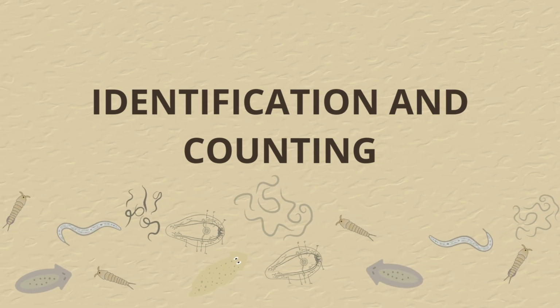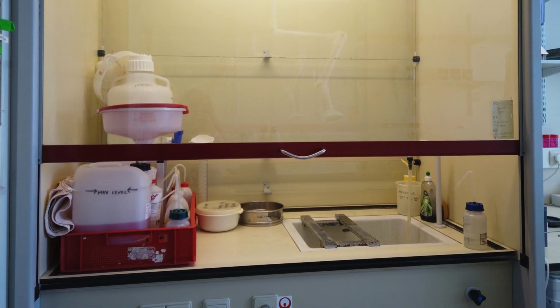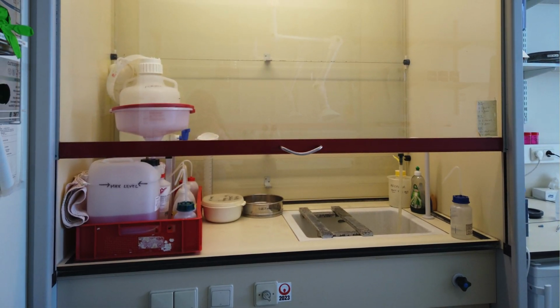Identification and counting. After extracting Meiofauna organisms from an environmental sample, the following steps are involved in their identification and counting.